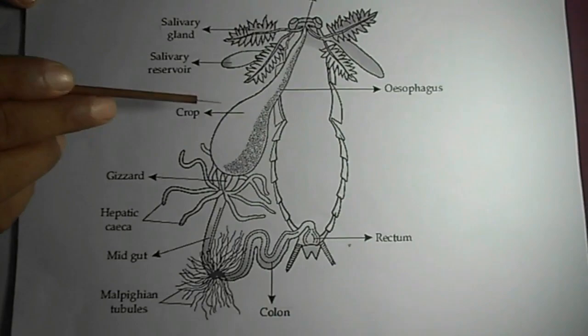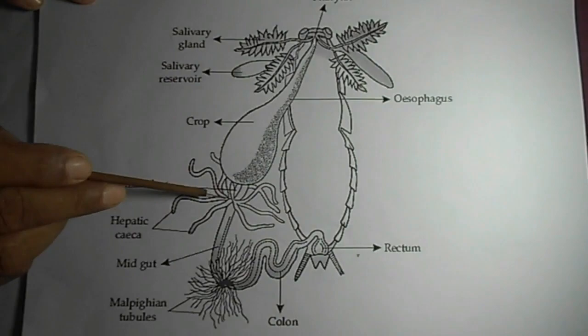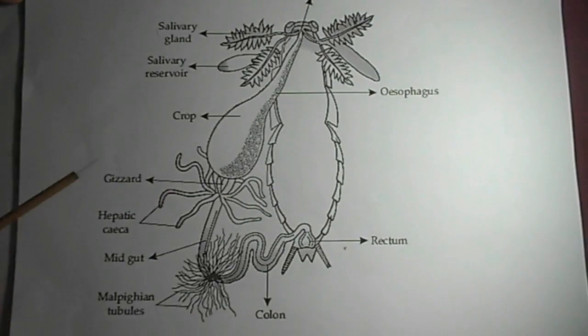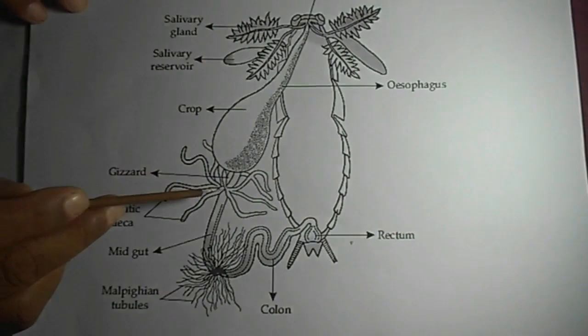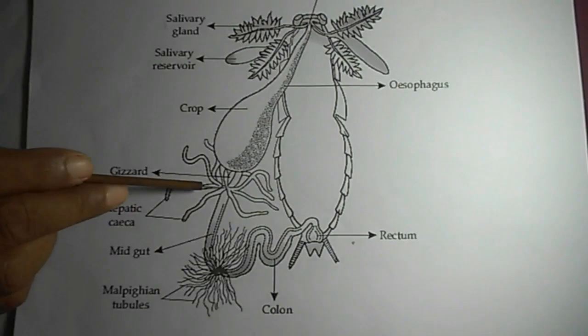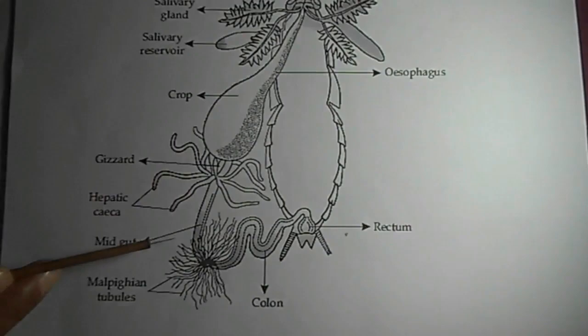After passing through the thoracic region, the esophagus dilates, and this dilated part is called the crop. This is a very muscular dilated part. After the crop, there is a round muscular structure called the gizzard. It is highly muscular and internally has chitinous teeth through which food particles are crushed and sieved. Here we see eight hepatic caeca hanging in the haemocoel.